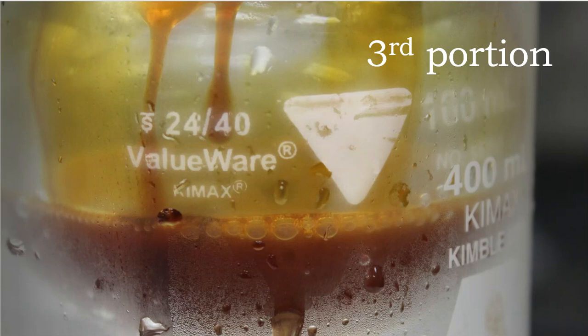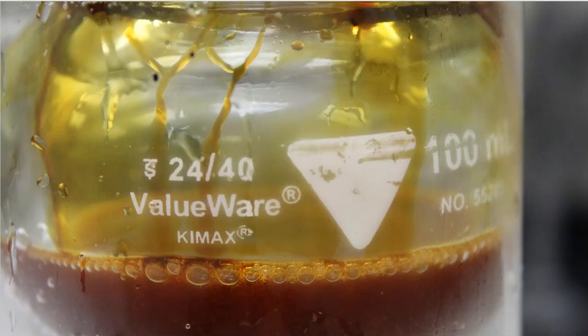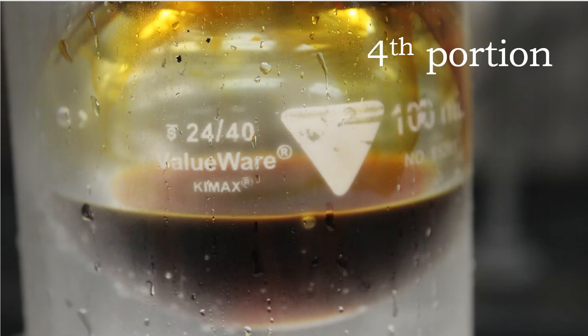All right, so here's the third portion. And as I added the third portion, notice that here at the very end of that 5 minutes, it's still a really darker color that did not lighten up again. So I'm not waiting around anymore. I'm going to go on to my fourth portion. My fourth portion happens at 2:46 p.m. And then I add my iodine and THF. And folks, make your observations the way that you need to here.